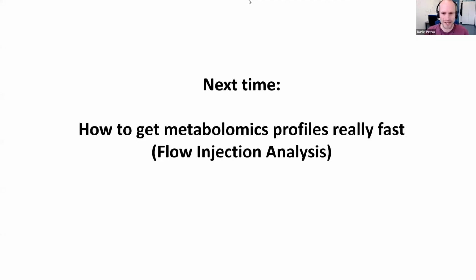Just a primer for two weeks from now, we're going to have Hannes Link showcasing their flow injection analysis pipeline. We've talked a lot about LC-MS-based metabolomics, but he will showcase how we can get metabolomics profiles without doing any LC.